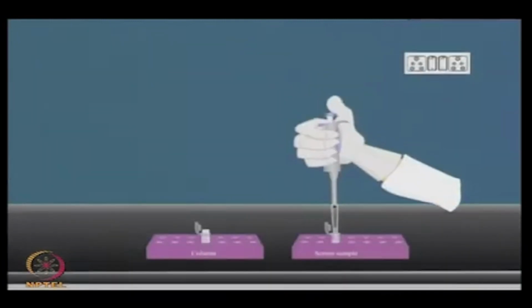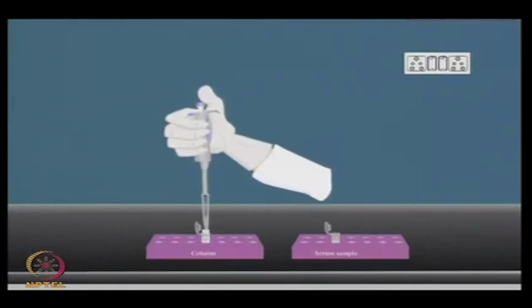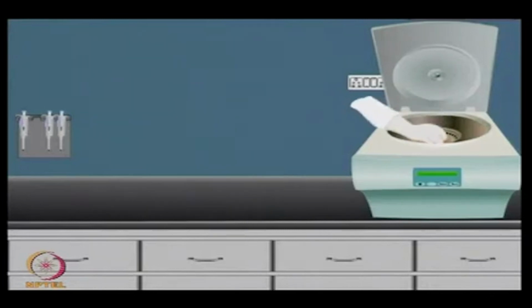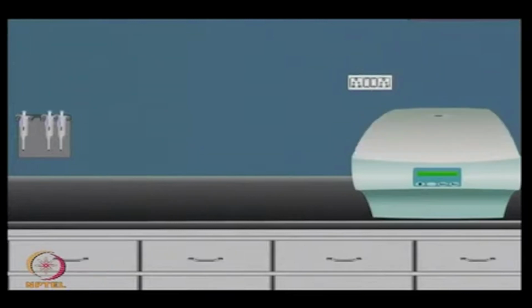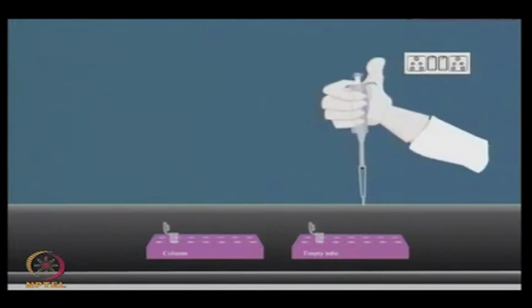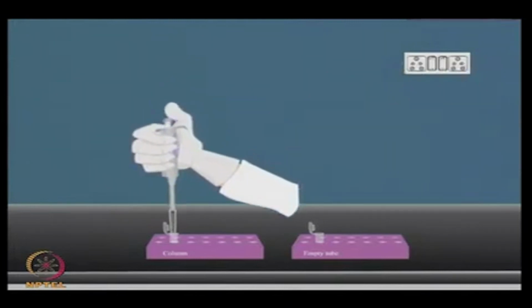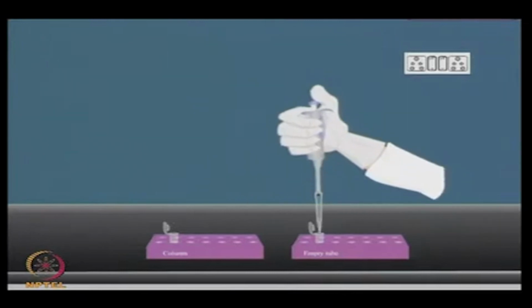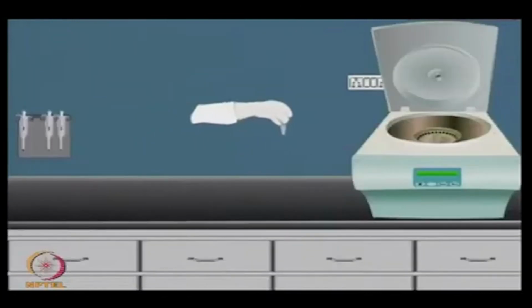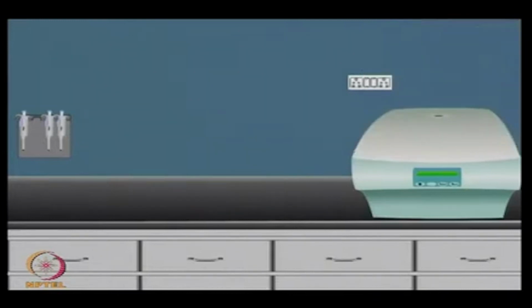After sonication is done, we can add the serum sample on the columns. Usually these are commercially available, which can deplete various high abundant proteins. Now, these depletion columns bind only the high abundance proteins onto their matrix through affinity interactions. Once the serum has been processed using a depletion column, precipitate out the remaining proteins by using trichloroacetic acid and acetone.